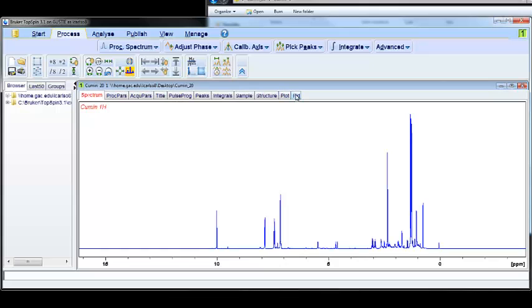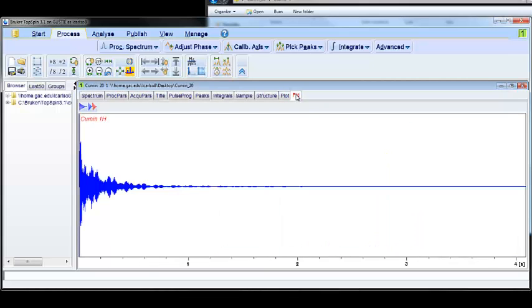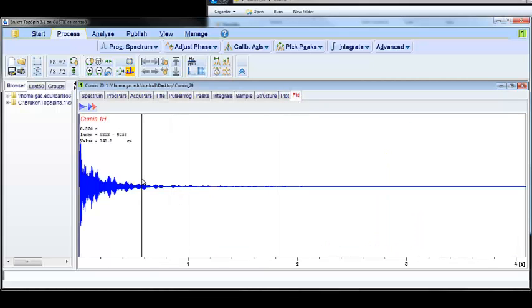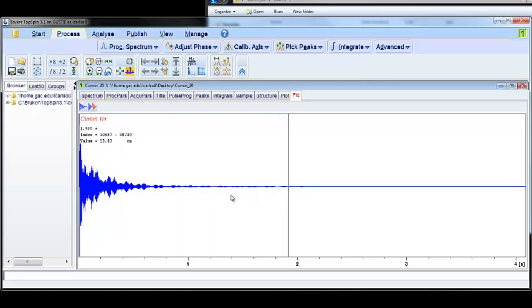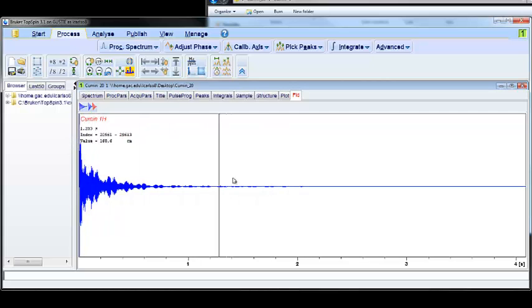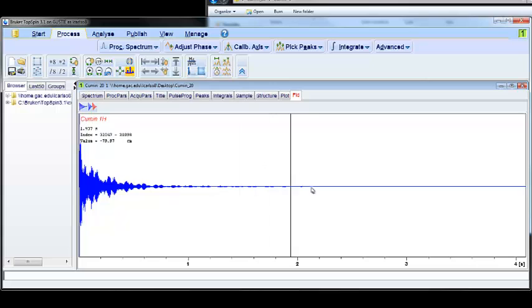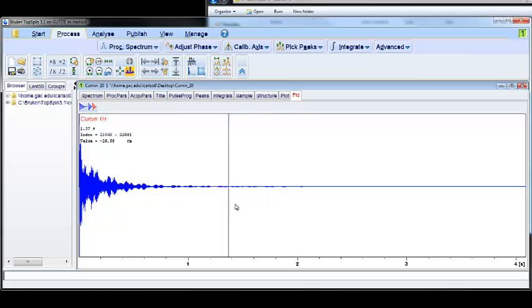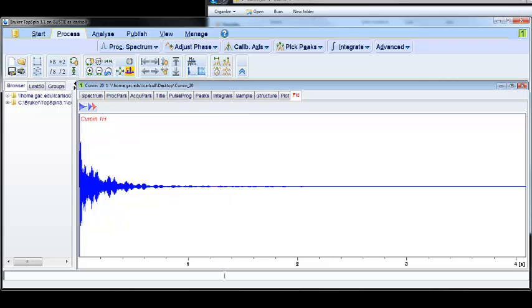If I go back to the FID, you'll see that the typical shape of an FID is kind of this tapered arc. A lot of these points out here, these small data points, are actually noise. They're not true signals from your sample. To improve the signal-to-noise ratio, we can perform what's called exponential multiplication, which is a mathematical function that truncates the data and improves your signal-to-noise ratio.